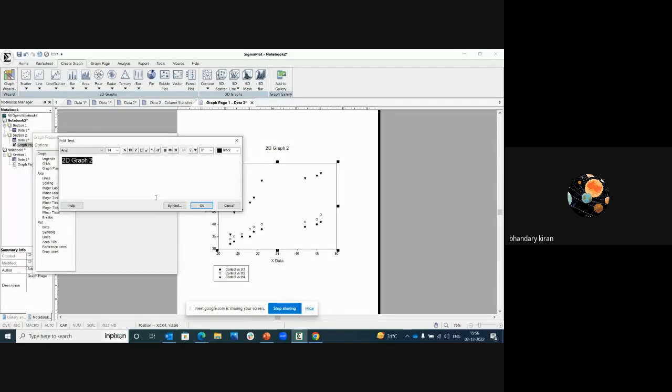I'm going to change the title name to multiple scatter, and you can change the format here, and you can change the font size here, and normal, bold, italic, underline, superscript, subscript, scientific symbol also you can apply in the title. And you can change the direction by using this option, and you can color the title also under this coloring option. I'm just coloring the title.